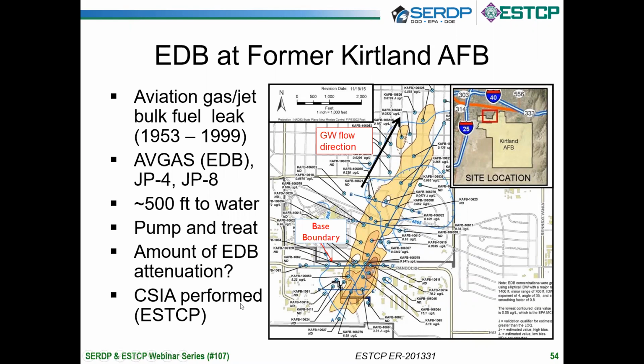So this is a case where you had to develop methods to deal with those low concentrations and concentrate the EDB. And also you had some locations where you've got NAPL and high hydrocarbons, so you have to look at EDB within those hydrocarbon areas. And Tomas Kuder at University of Oklahoma did a great job advancing these methods. That's published in an ESTCP paper as well as for this project.